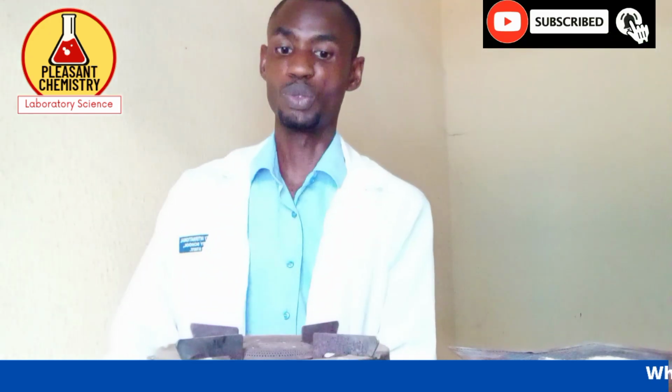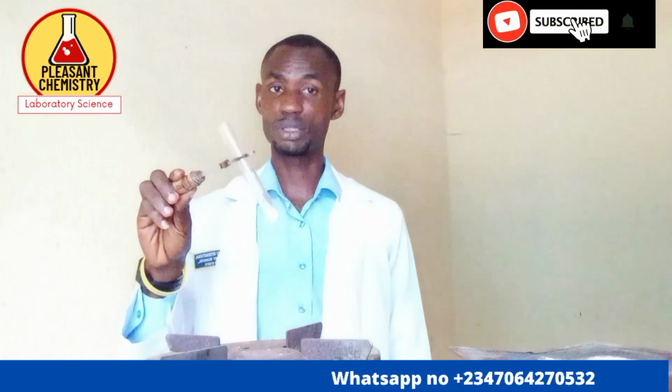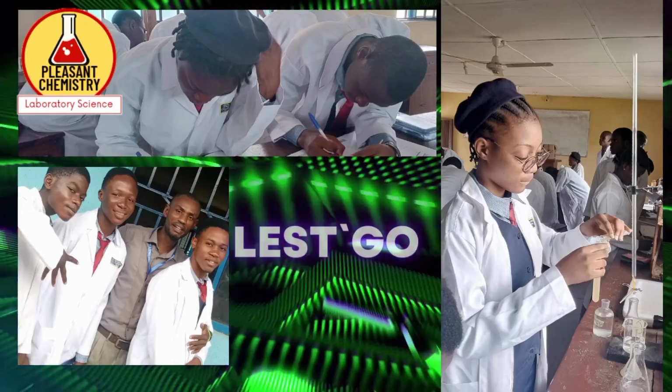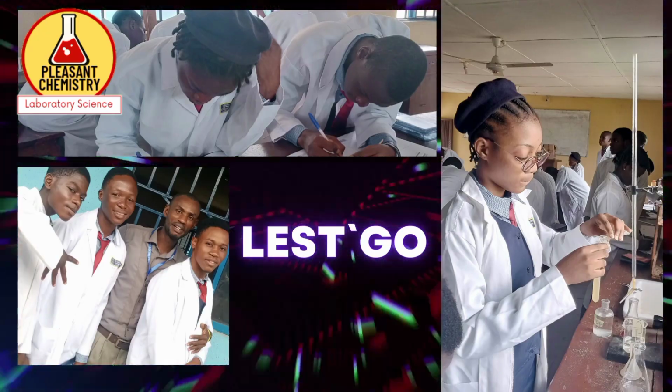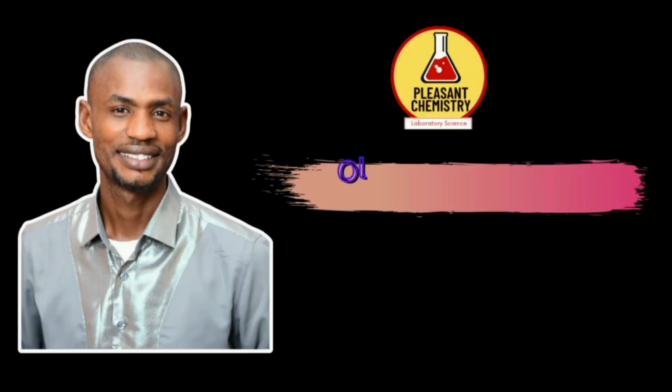So I want to carry out a test on salt, and this is the salt I'm going to carry out my test on. I'm going to test with litmus paper in case there's a gas involved. So with this litmus paper, we're going to determine the kind of gas that is involved.